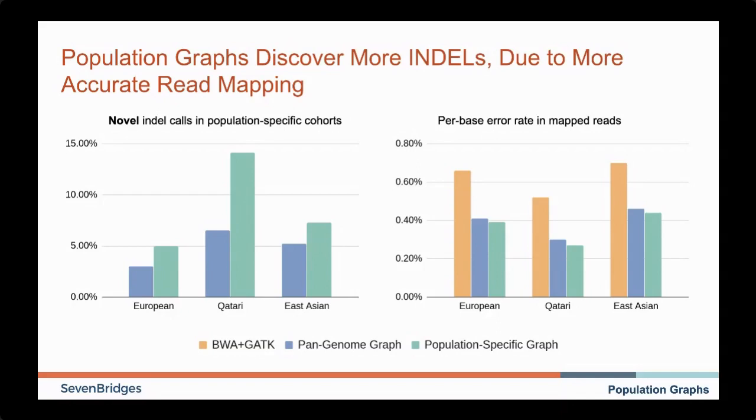For examining genome diversity, how could using a pan-genome graph compare to tree sequence format? Okay, I will take this. So I think what the questioner is wondering about is that if you map a sample using a graph genome, can you use that mapping information to identify the subpopulation that a sample comes from, as you do with phylogenetic trees?